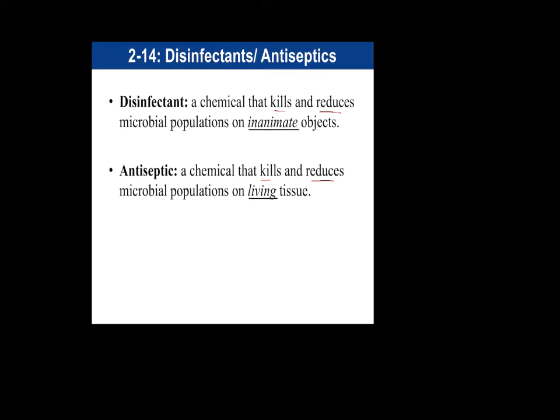Where you're going to be seeing disinfectants being used, let's say in the home, is perhaps to lower the microbial load of your cutting board, of your sink. Perhaps you'll use disinfectants when cleaning the bathroom or door handles. So disinfectants are going to be used in the home. We'll see them used in the medical industry all the time to disinfect surfaces.